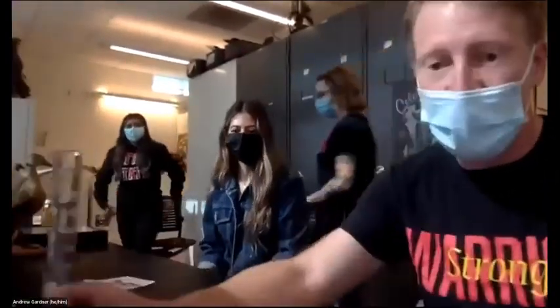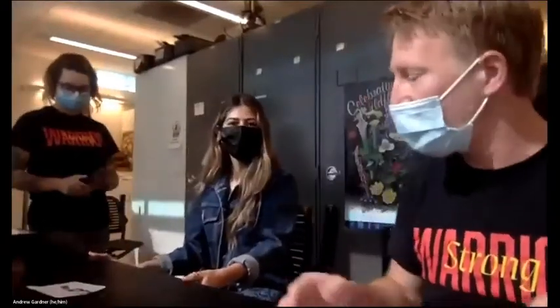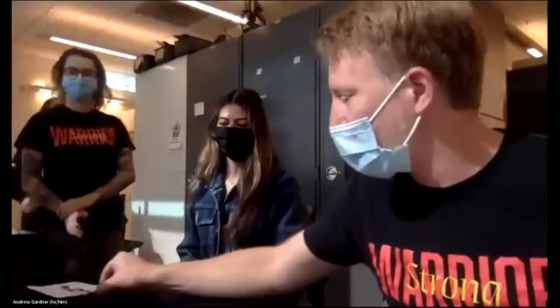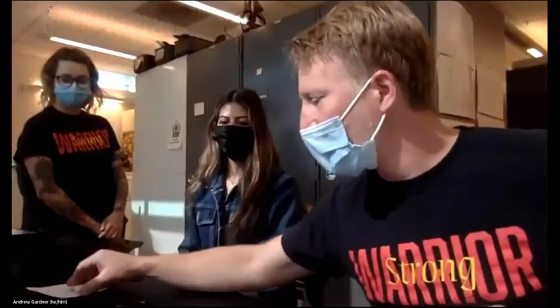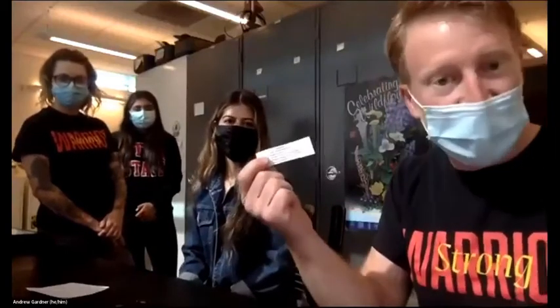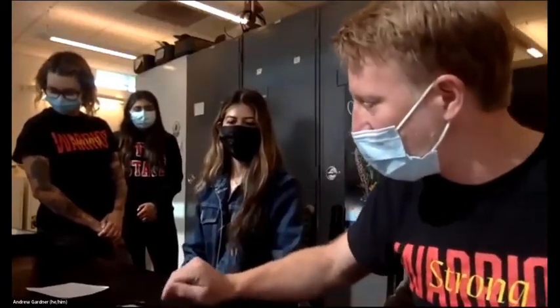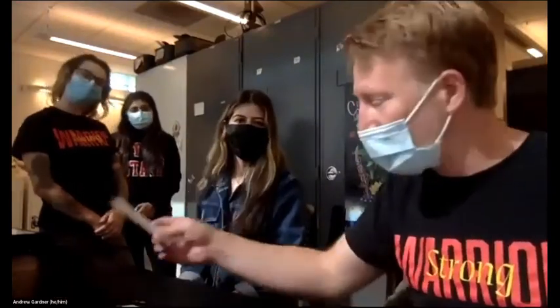Now would be a great time for people to pass out the little individual specimens. Everyone should have some kind of pressed plant material. Here's a little piece of Clarkia. Along with that, you'll need an appropriate label because scientific specimens have labels. And you'll need a piece of paper. So we'll give people a couple of minutes here to make sure everyone's got what they need. Of course, you also need some glue.